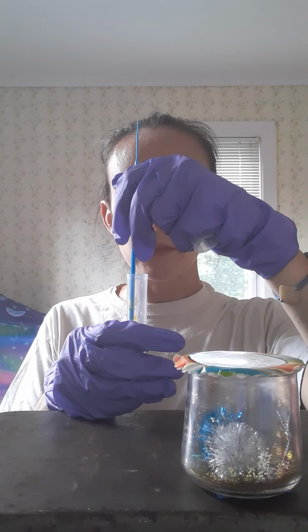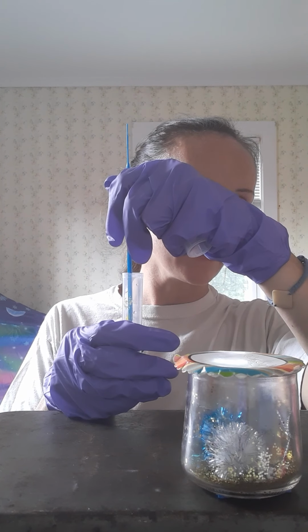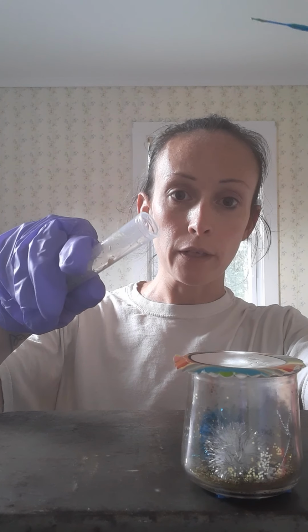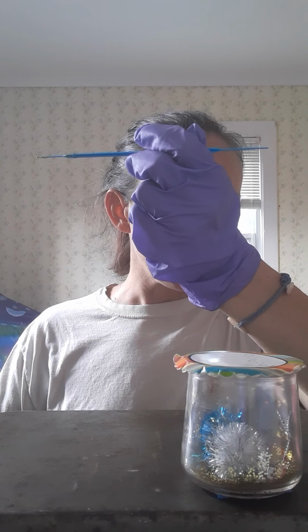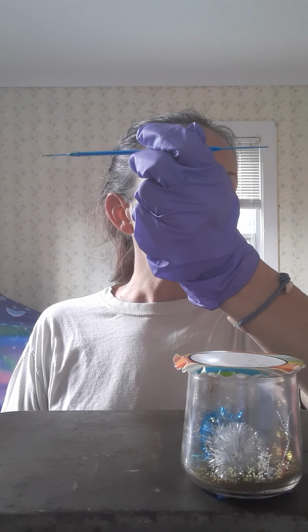We're going to stir it a little bit very gently so that it is distributed evenly. Again, we're going to pull the inoculating loop out, and we're going to run the top of the tube through the Bacto incinerator again and close that, and then we will put that back in the test tube. So from there, we will sterilize the loop through the Bacto incinerator as well, and then set it down.